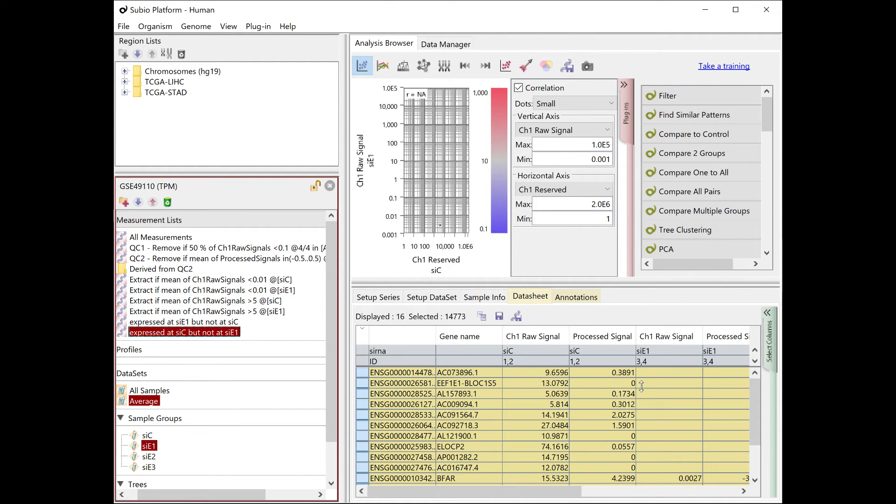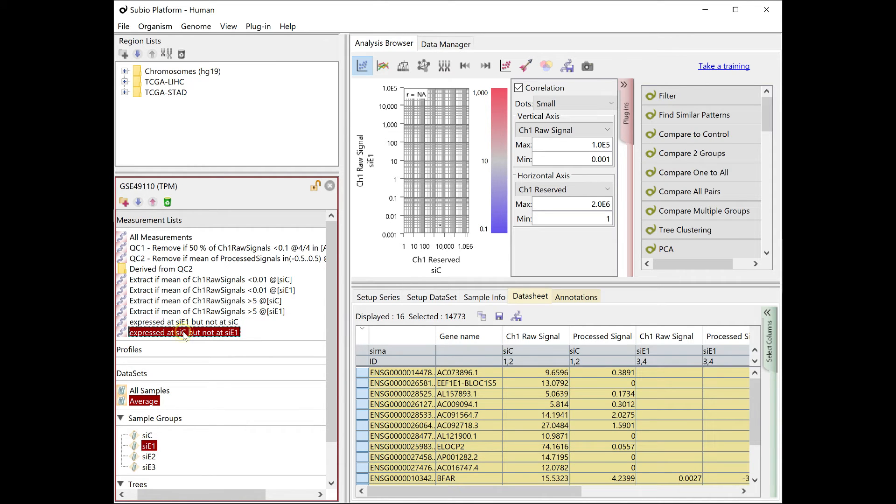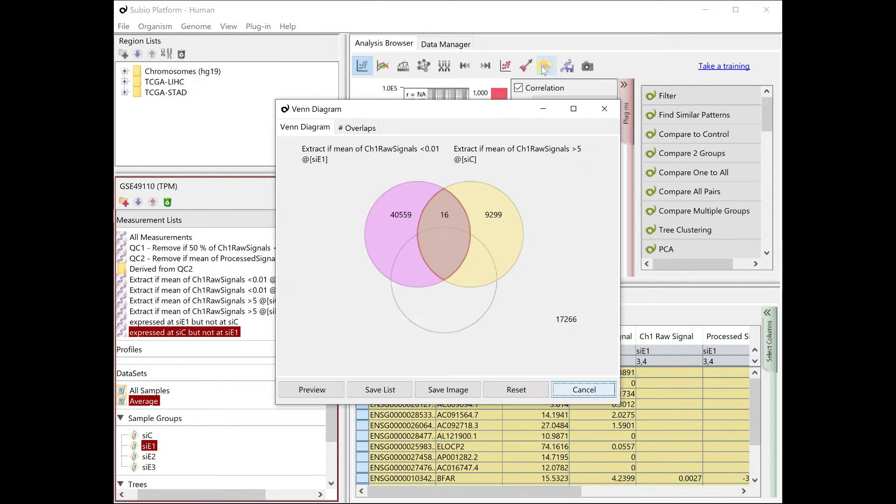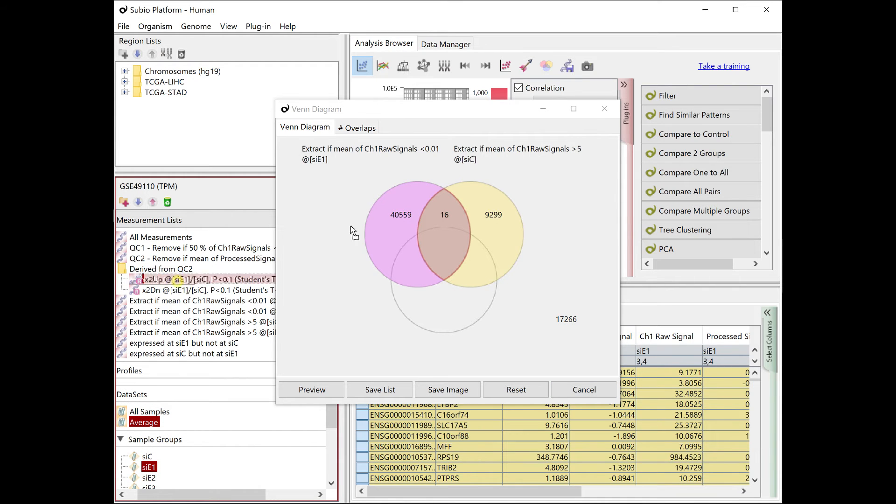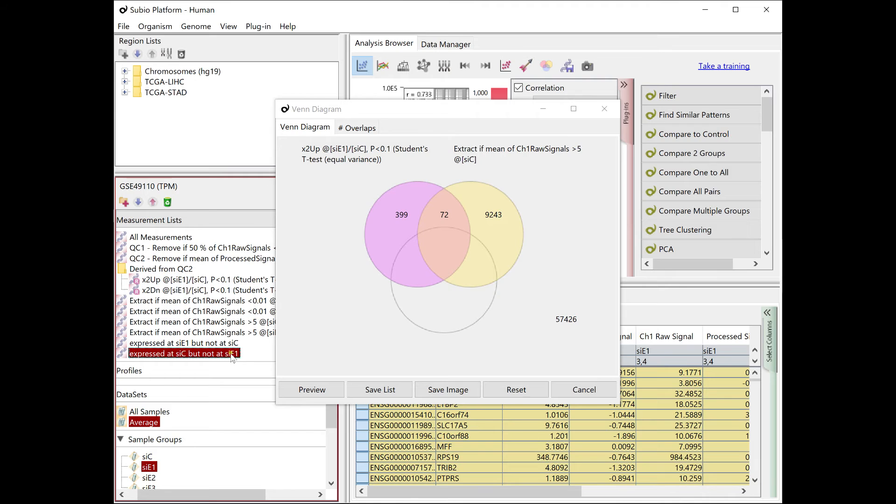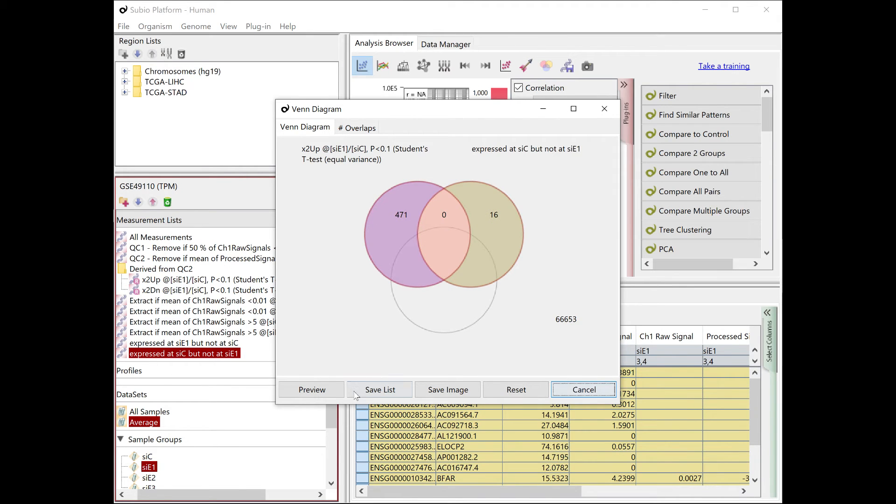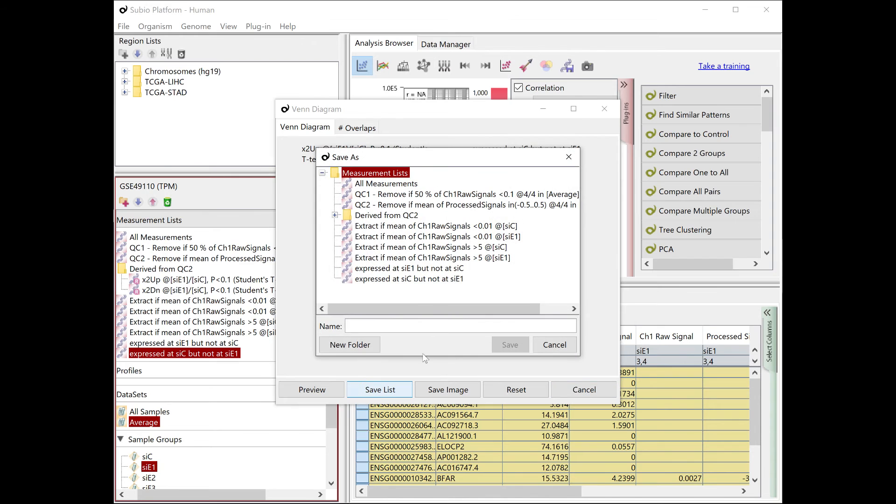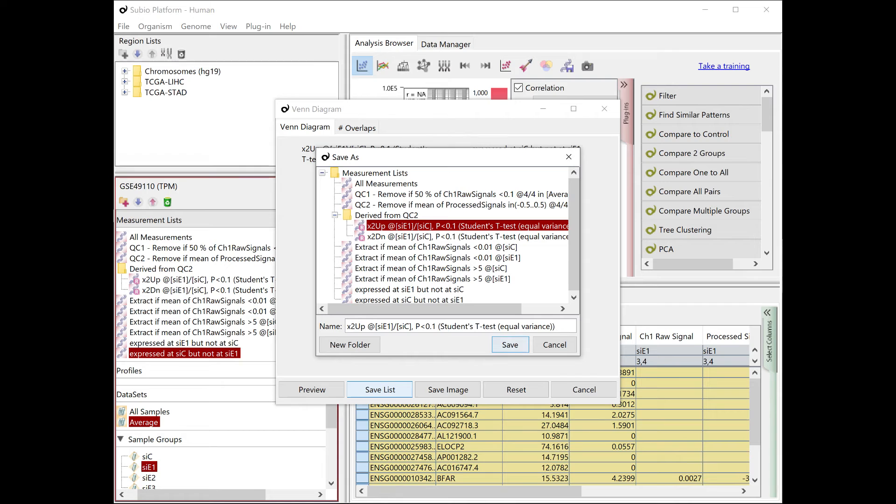These are also candidates for genes with differential expression, but you missed by filtering fold change or p-values. Therefore, by merging a list made with fold change and p-values and a list of genes with without measurement values, to get the final list of genes with differential expression.